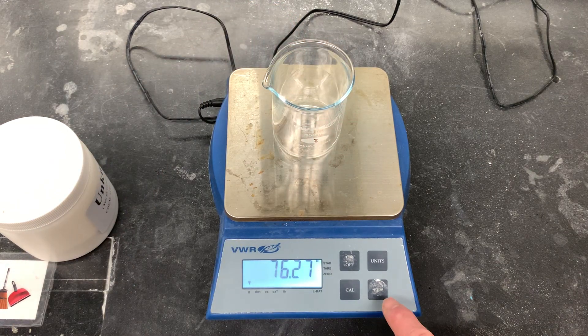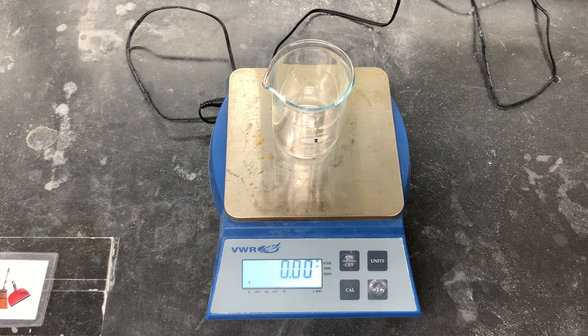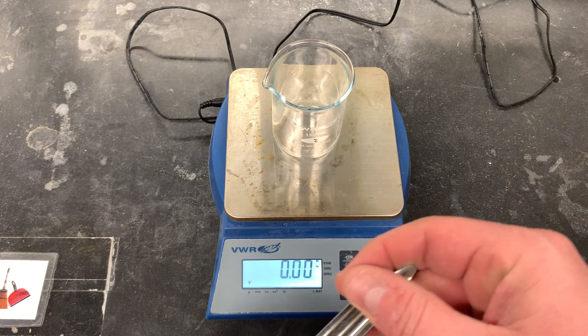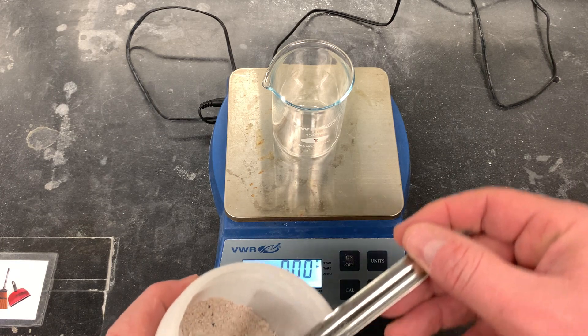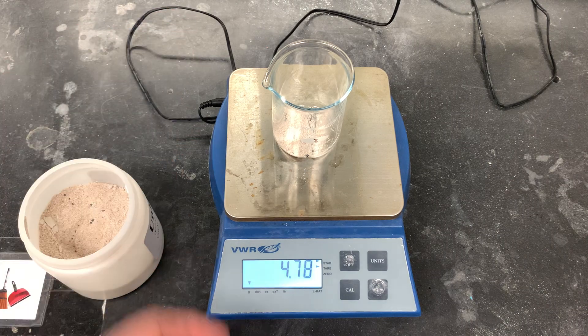Put your beaker on the digital balance, press the T to zero out the digital balance, and then the lab manual tells you to get approximately 2 to 3 grams of your unknown sample. That's just a rough range, so whether you get 2 grams or 3 grams, it doesn't really matter that much. You just don't want to get too much more.